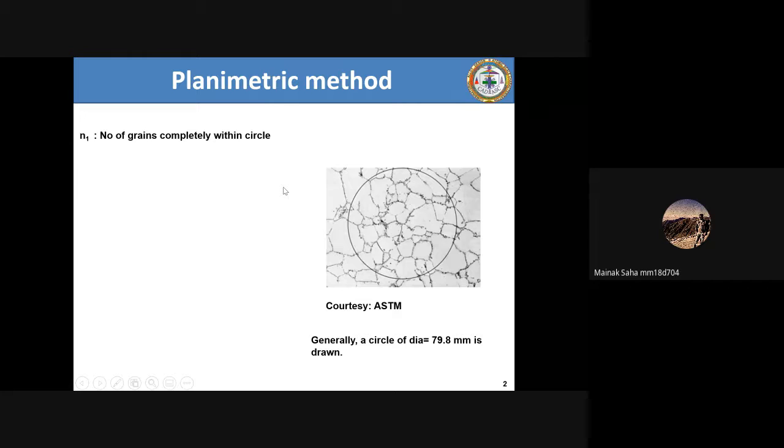Recount a bit. Not 30, I mean, a bit less. So around 20. Yeah, I mean, it is around 24 grains actually. Within inside, you have around 24 grains. Okay, and so that is N1.